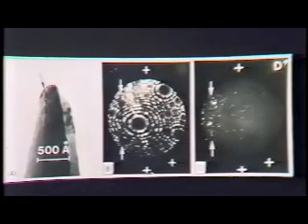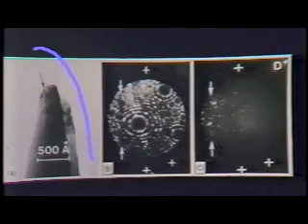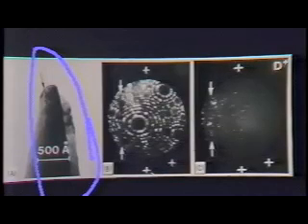Well, here's a sequence that shows you a transmission electron microscope image, fascinating pen, of a tip with two grain boundaries. See them? Okay. This is a corresponding field ion microscope image in which one of the grain boundaries we see as a dark line. Remember, if we etch through two single crystallites in our wire, we see a grain boundary in the image. In fact, field ion microscopy was the first technique that showed that grain boundaries don't extend into the lattice by many, many, many angstroms. There's a very abrupt step.